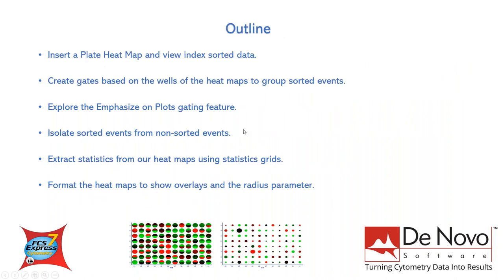For today's webinar, we'll be focusing on learning the ins and outs of index sort data with plate heat maps. We'll show you how to insert a plate heat map and view the index sorted data, create gates based on the wells of the heat map to group sorted events, explore the emphasize on plots feature, use color dot plots to isolate sorted events from non-sorted events, extract statistics using heat map statistics grids, and format heat maps to show overlays or multiple files and statistics using things like the well radius parameter.